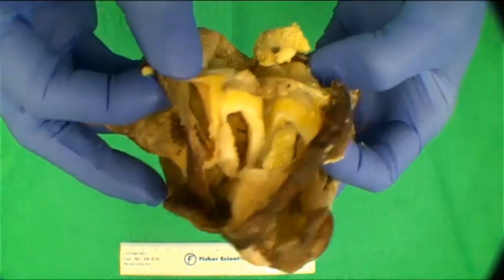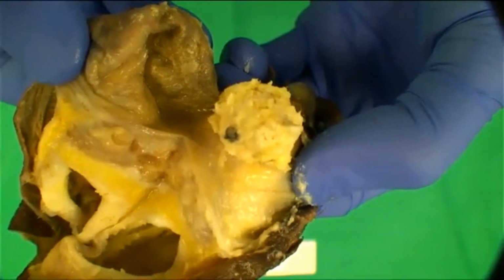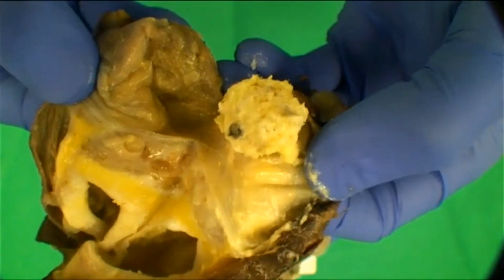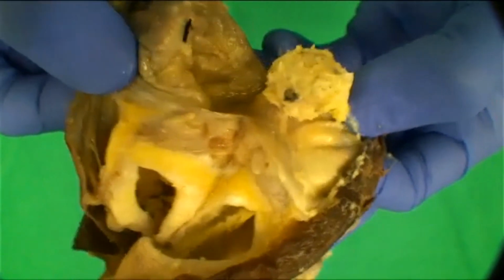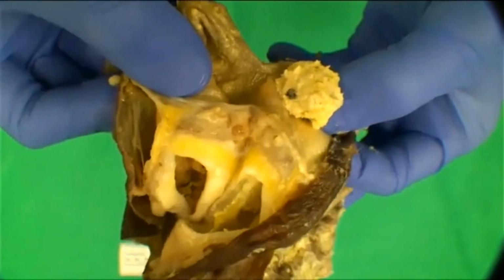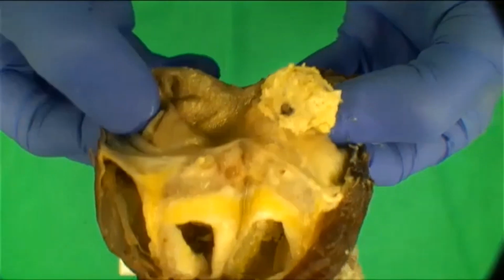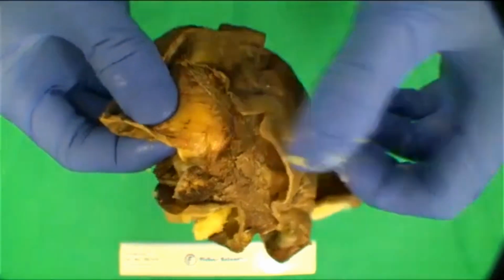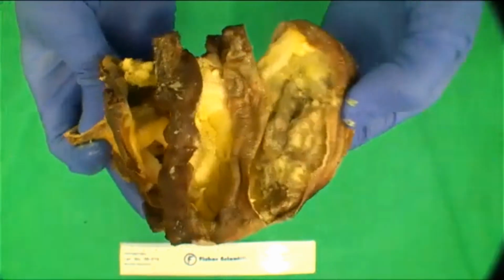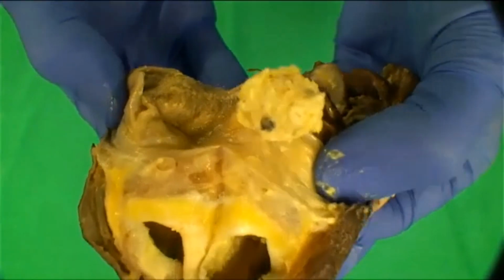But when it comes to the Rokitansky nodules, once you cut through them, you're going to find there's these calcified foci in them. They may just be calcified foci, or they might look like teeth, more rudimentary teeth-like structures. When sampling the Rokitansky nodule, you'll want to submit them in their entirety and just getting around and cutting through and dissecting around some of those calcified components. If you have the fallopian tube attached, you'll also submit that as well. In terms of the number of sections, generally speaking, again, 1 per centimeter, and again, finding all those Rokitansky nodules and submitting them through in total.